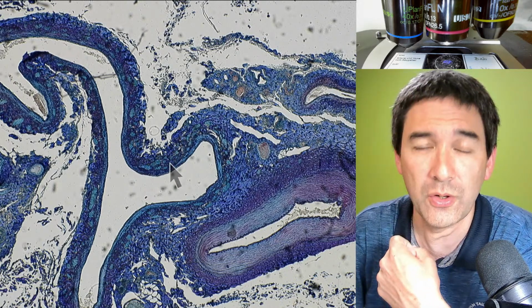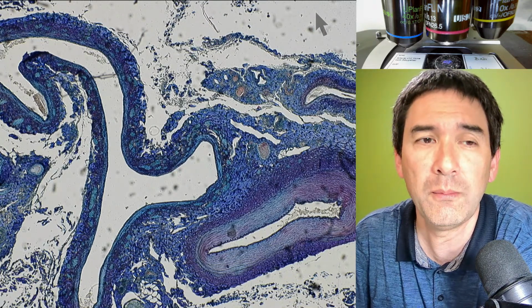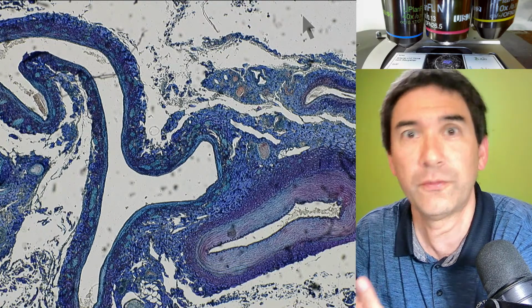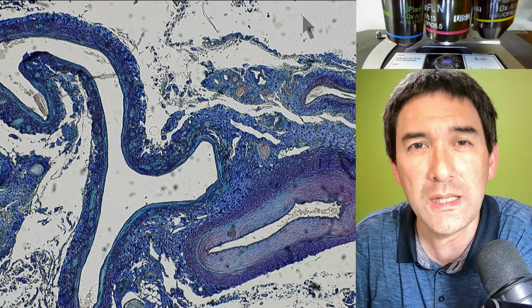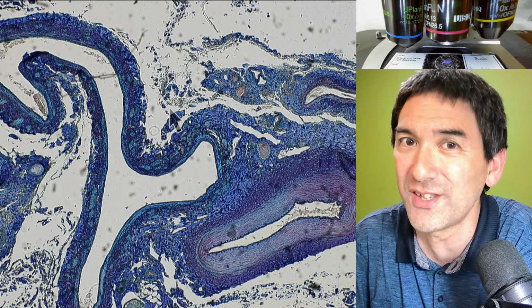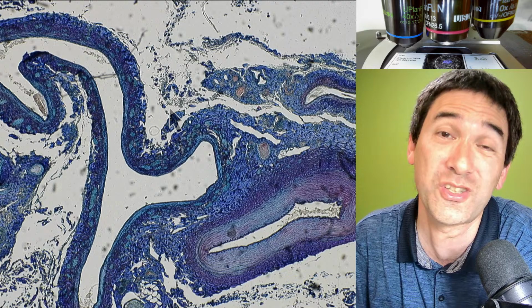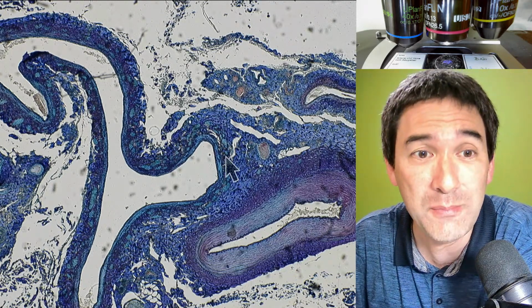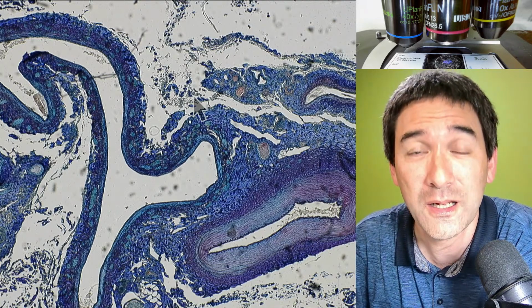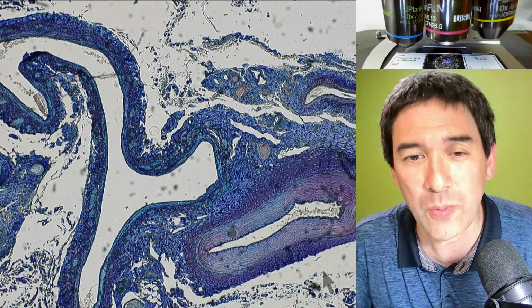Now, some people have suggested, why don't you just write down 4 times here in the corner? But that is again misleading, because if I write 4 times here in the corner, because I'm using the 4 times objective, this could also mean that this is actually magnified 4 times more than in real life, which it is not. Because there are 2 different types of magnification. One is called linear magnification, the other is just called magnification. Because how much this image is magnified as you see it on the screen depends on the size of your monitor as well. So this is again a different type of magnification. This is a little bit misleading, and this is why it's sometimes difficult.